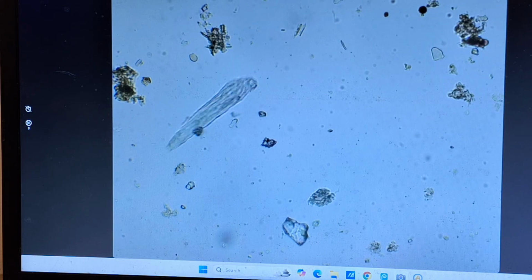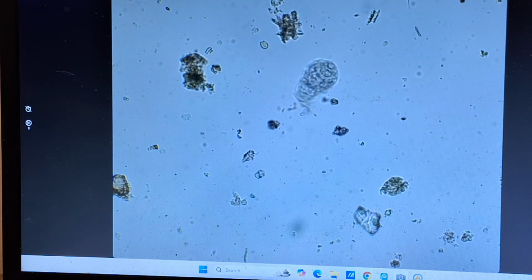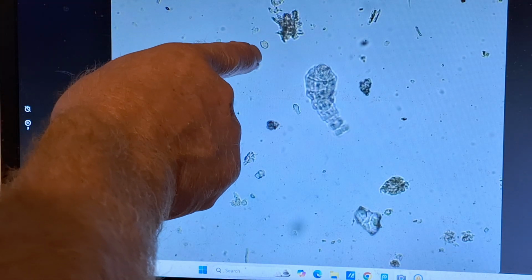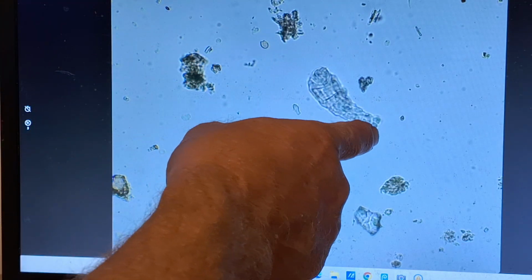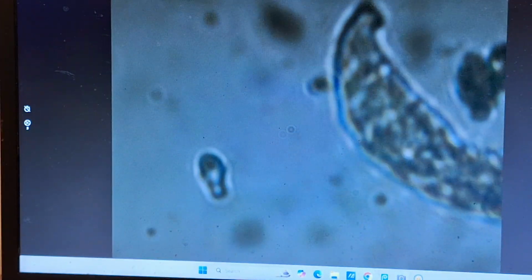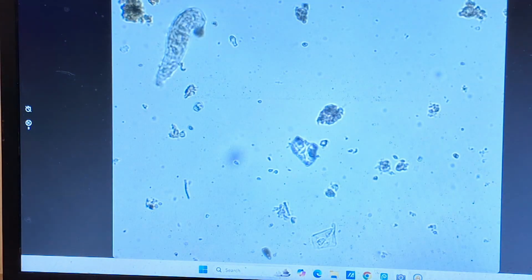I think we say certain ones feed on certain things, but generally I'm going to think there's probably quite a bit of omnivoreism going on, eating what they can. There's a nice testate amoeba right next to him now. Here we're going to see his mouth get going. Zoom in if I can and catch it. Oh, I'm missing it. It's hard. It moves so much.